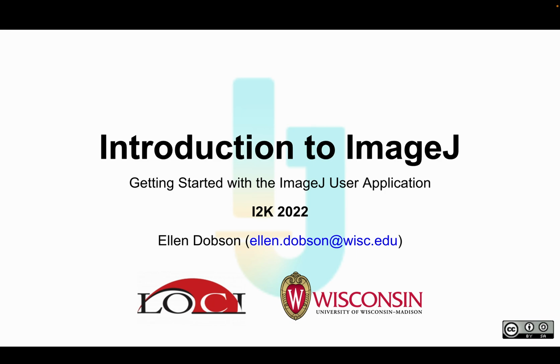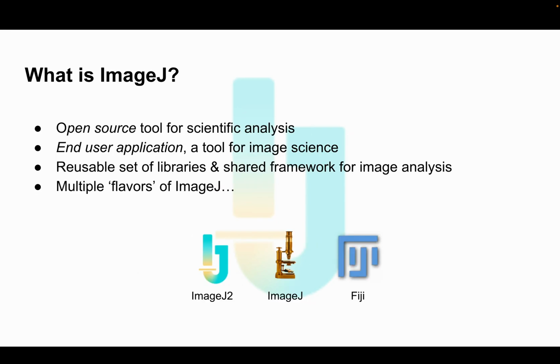Today I will be presenting a workshop called Introduction to ImageJ. We'll be getting started with the ImageJ user application. So what is ImageJ? ImageJ is an open source software package specifically built for scientific image analysis.